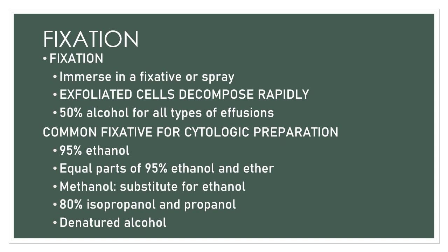And this 50% ethanol can be replaced with Saccomanno fluid. Okay, and so again, you have your common fixatives for cytologic preparation. You have your 95% ethanol, your equal parts of 95% ethanol and ether, and so your methanol, your 80% isopropanol and your propanol, and then your denatured alcohol.